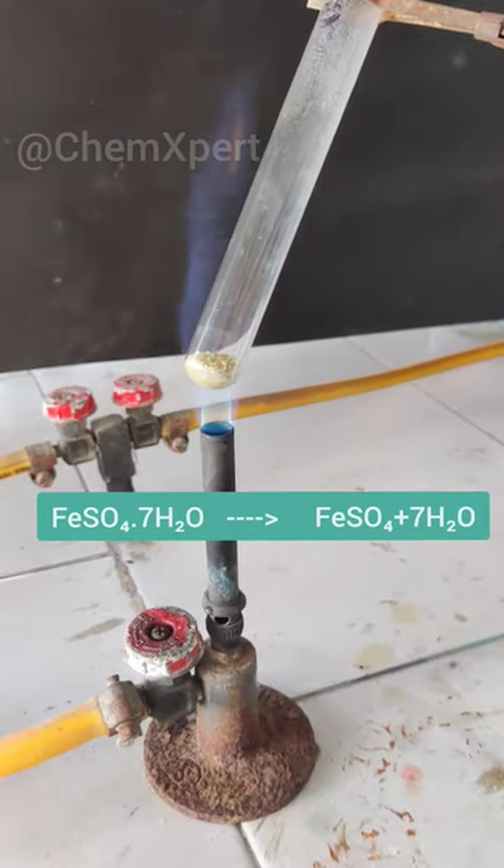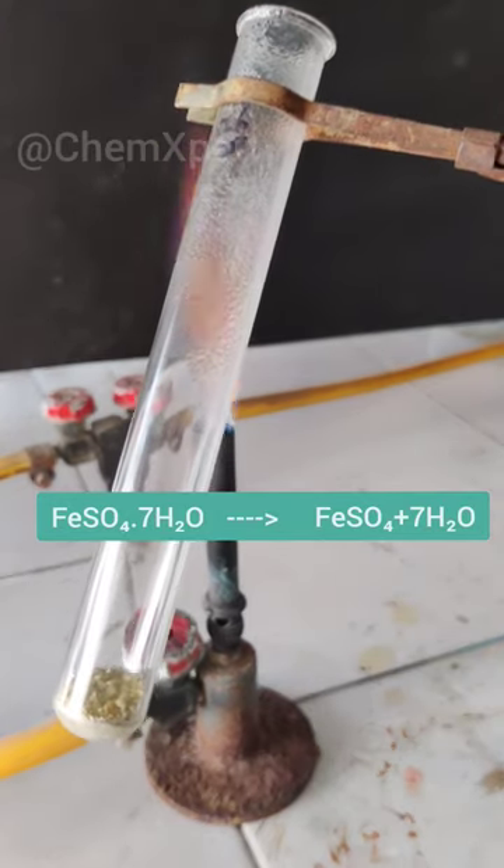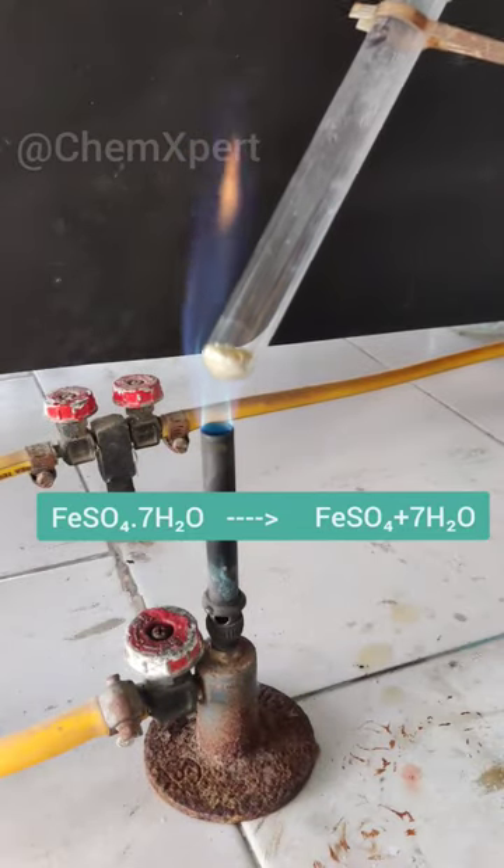You can observe here, at the neck of the test tube, water droplets are visible. These are the 7 water of crystallization which are evaporated from FeSO4.